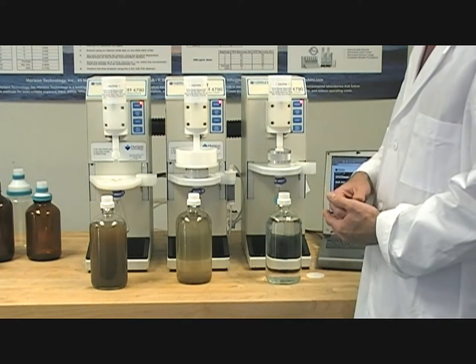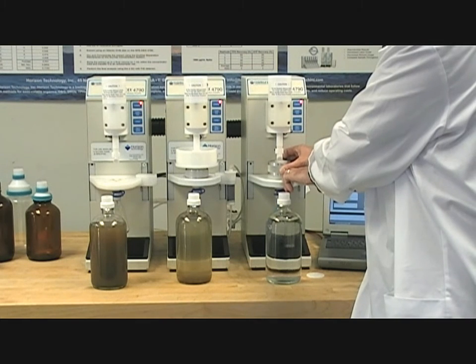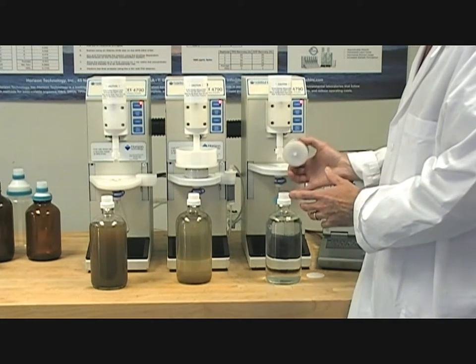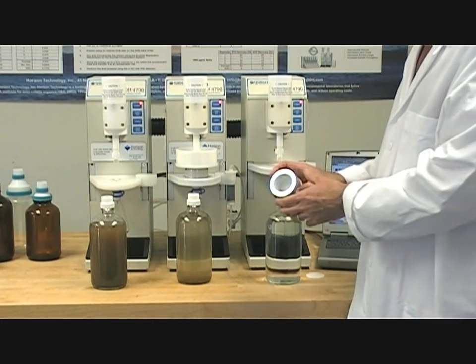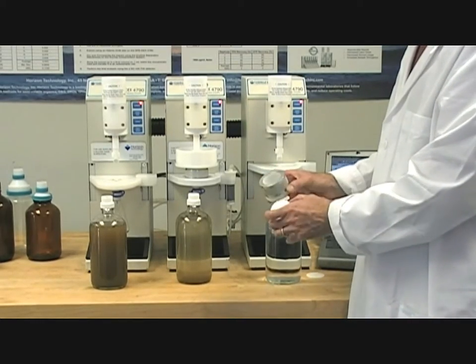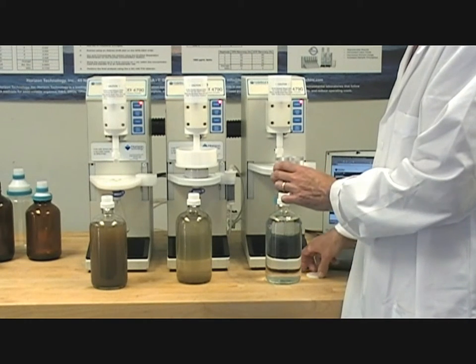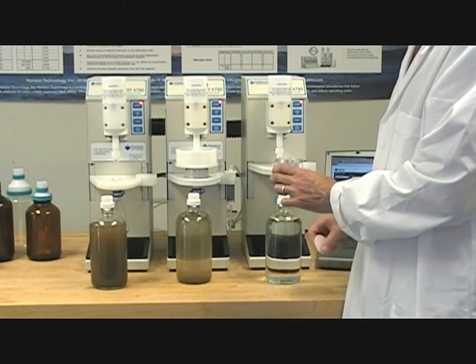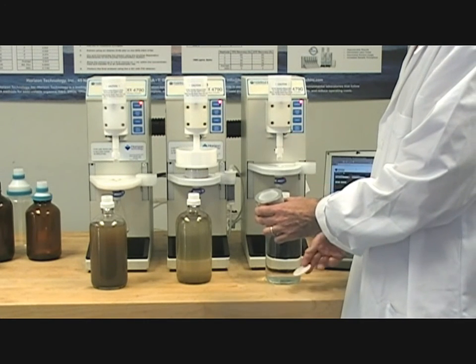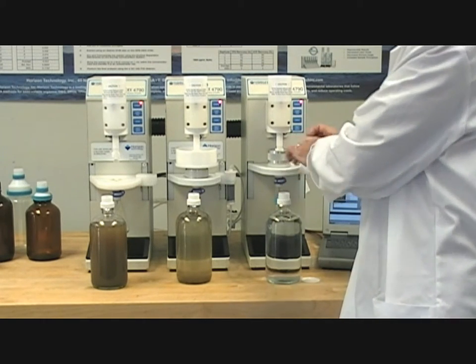We have a unique series of disk holders that all accommodate our 8271 pass disk — 47mm sized disk. In this case, with a clean water sample, we're going to use our 47mm disk holder, and the disk simply gets inserted into this, because we don't have to worry too much about clogging with such a clean water sample. If there was some particulate matter, we could also add a pre-filter to this disk holder, but in this case we'll use no pre-filters in our standard disk holder.